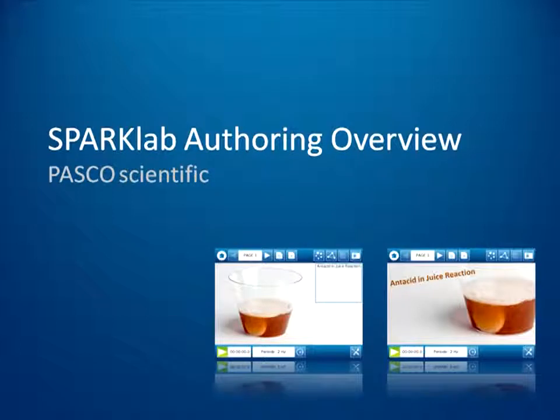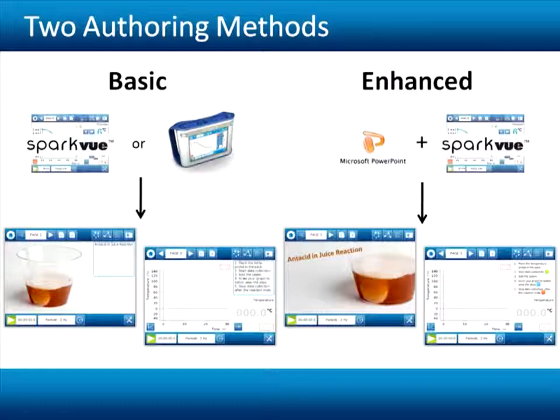Welcome to this overview of SPARKLab authoring. In this series of 4 short movies, I will introduce you to 2 approaches to creating SPARKLabs, the interactive electronic lab format used by PASCO's SPARKVue software and the SPARK Science Learning System.